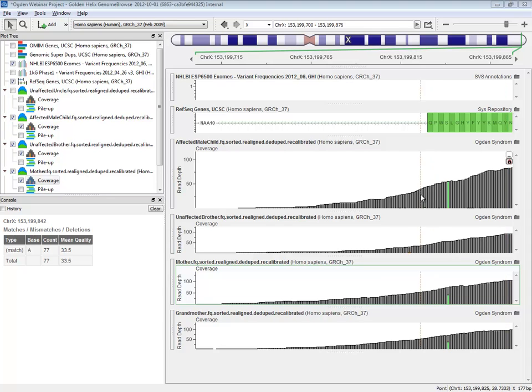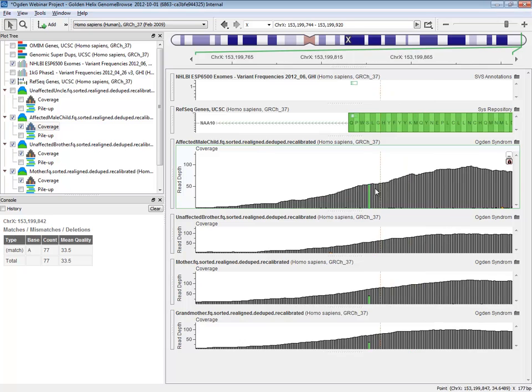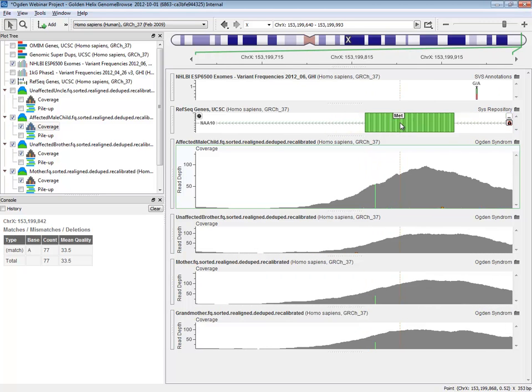Now, in the case of R, again, this is the distribution of reads. If you had genotypes over here, would you trust them? Why would you trust them when you know your variants are going to be centered around these exons, which by the nature of the assay are going to have high coverage? So those filters are specific to the experiment and specific to the sequencing choice here, and that's why you look at the histograms. You look at the actual data instead of making those up from complete scratch.